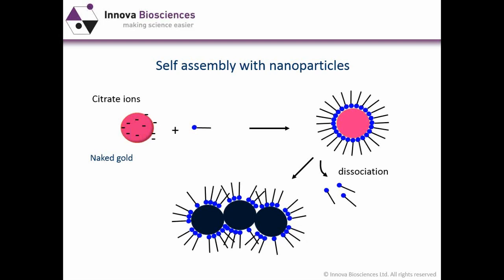What happens then is you have bare metal exposed, and the particles can aggregate as shown at the bottom, so there's a change of color and the whole thing turns into a mess. Now generally that's bad, but if you actually want molecules to dissociate, and there may be therapeutic applications here, then this is potentially a useful technique in that the molecule's not firmly anchored.